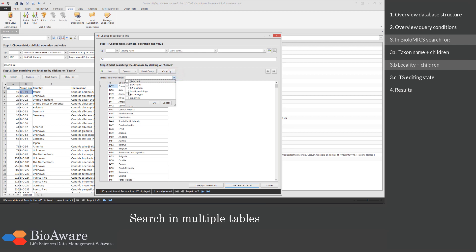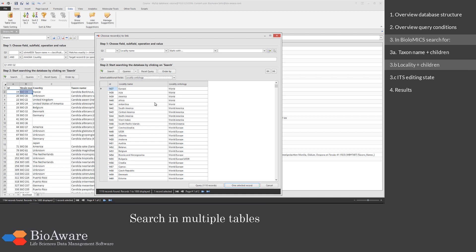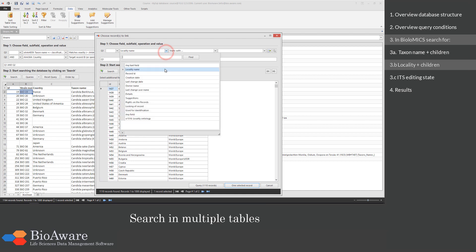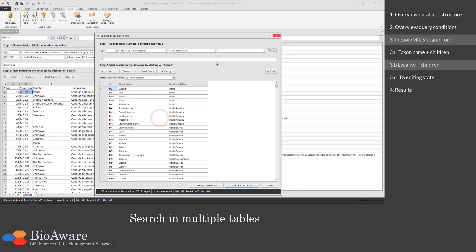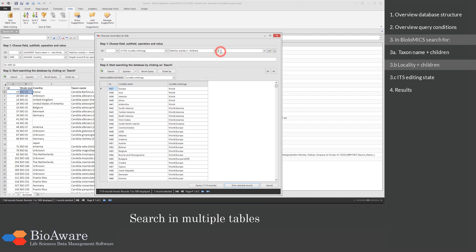Use the drop-down to add an extra field to the grid and to be able to search in this extra field. Here we want to search in the locality ontology field for the records that match exactly Europe, but also the children of Europe.